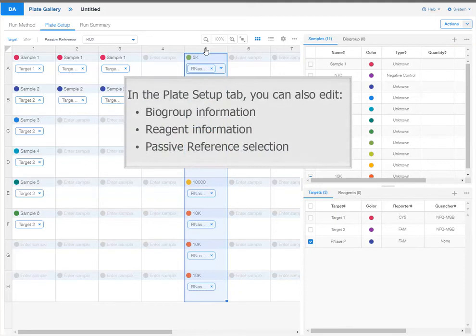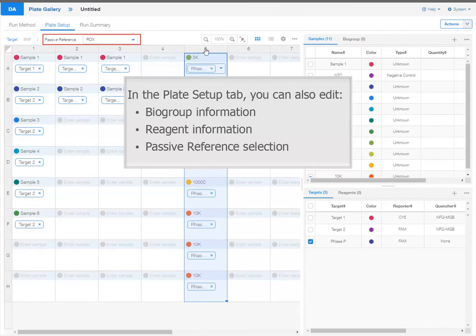In the plate setup tab, you can also edit bio group information, reagent information, and the passive reference selection.